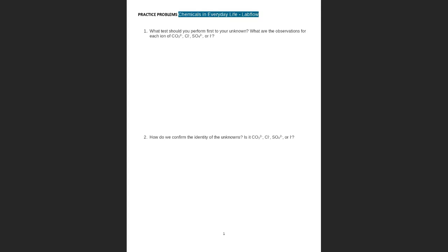The good part is that you know your unknown is going to be one of these four. I have carbonate, chloride, sulfate, or iodide. Only one.